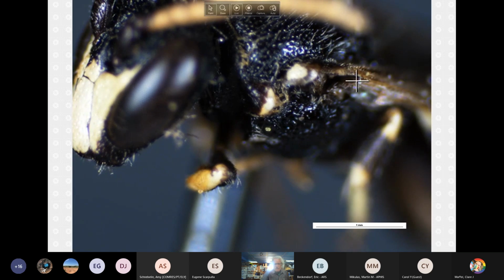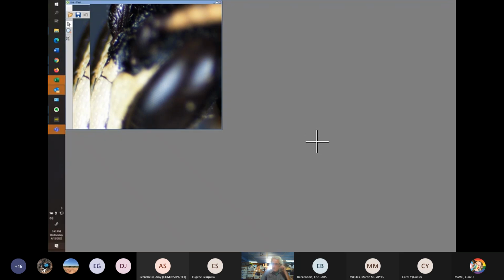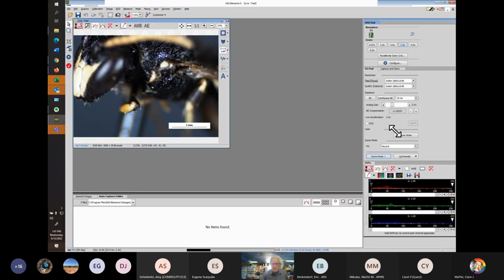So we're going to be looking down this edge. So there's the pronotal lobe. This is the sharp edge, lateral face, anterior face. Legs would be tucked in there. For whatever reason, it has a sharp face now, and it has a raised line. You would not see that. It'd be just rounded over in the others.